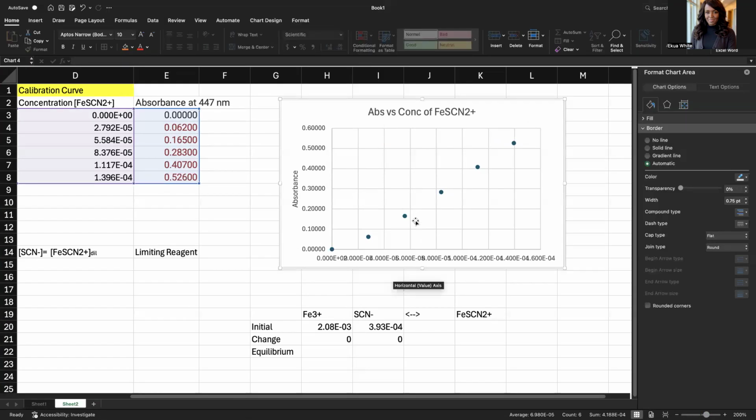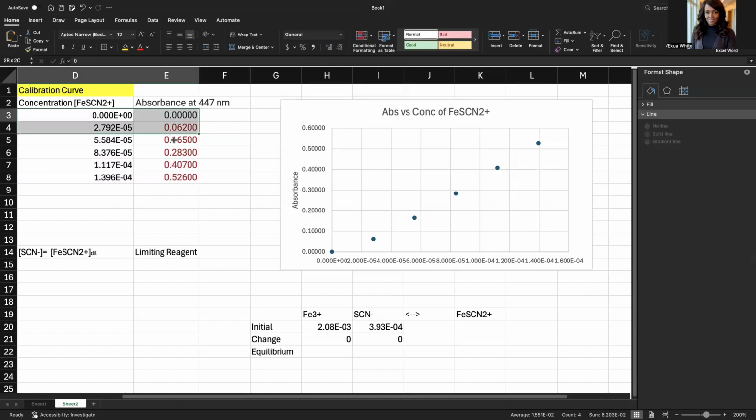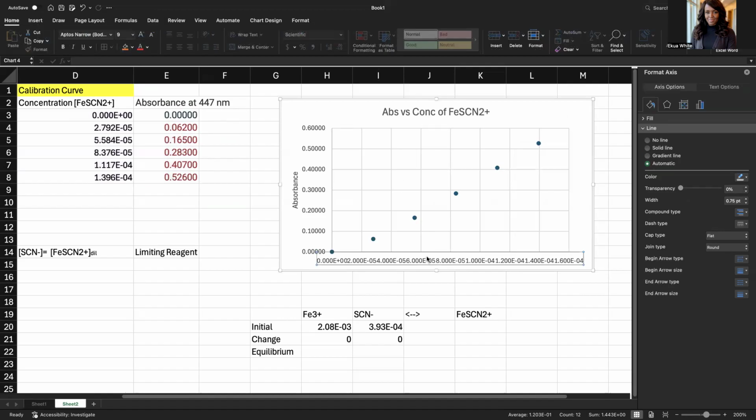So we have these numbers here, and hopefully they're not overlapping that much. But y'all saw my numbers, right? Now I have to add to this. Where am I at? I think I got a little bit lost here.